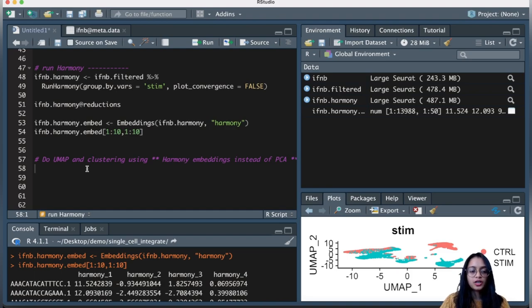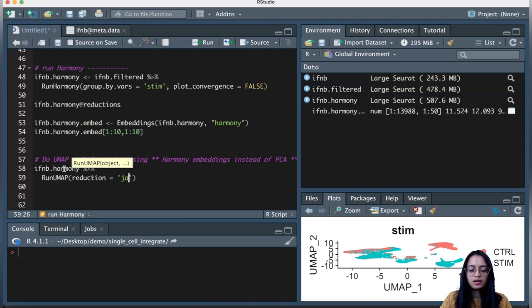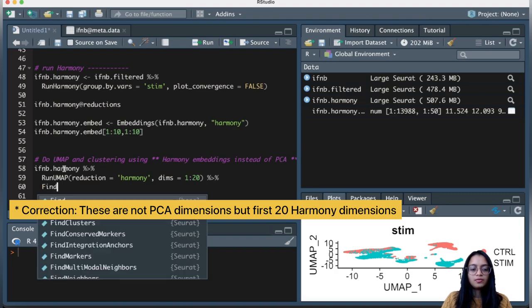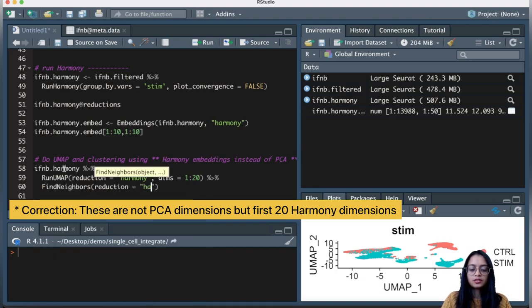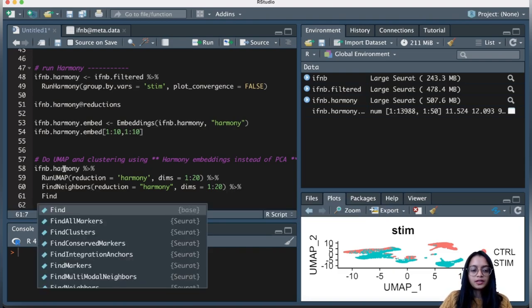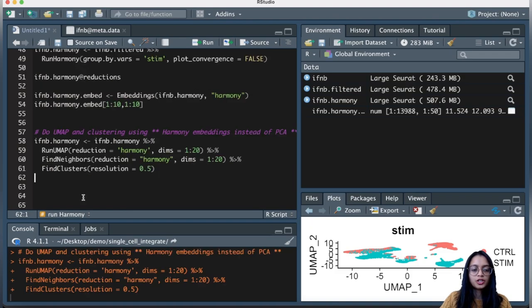Let's run UMAP on the harmony object, specifying reduction as 'harmony' because we want to use the harmony embeddings, with the first 20 dimensions. Then we find neighbors again using reduction 'harmony' and the first 20 dimensions. Finally, we find clusters using resolution 0.5. We assign everything back to the harmony object and run all steps.